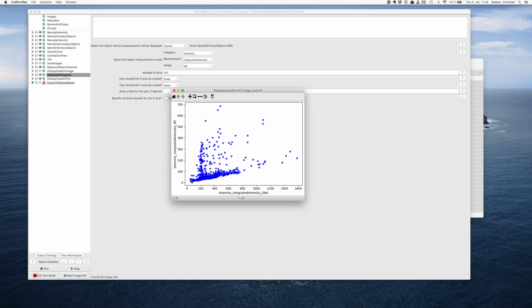You can see, so this is an infected field of view, that we have a couple of negative nuclei down here. The nuclei intensity scales with this NP intensity. That's just size, I think. So it can probably also be normalized by the size, but we don't do that now. So we have these negative nuclei, and we have a bunch of infected cells. And the goal of the next part will be to extract the number of infected cells from that image.